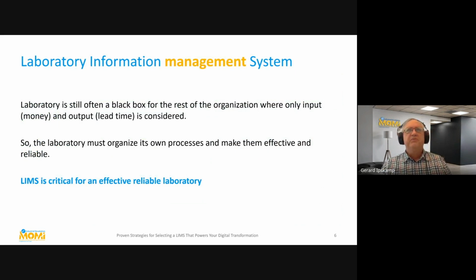The other thing I want to mention very clearly is that for me, if I talk about a LIMS system, the M is something. A laboratory information management system means that with the system, you also manage your laboratory. For the rest of the organization, and we still see that, it was that way 20 years ago and it's still the way, a laboratory is a black box. You put money in, and you hope that you get the results out as quick as possible, so the lead time, and that's all that the rest of the organization is interested in.